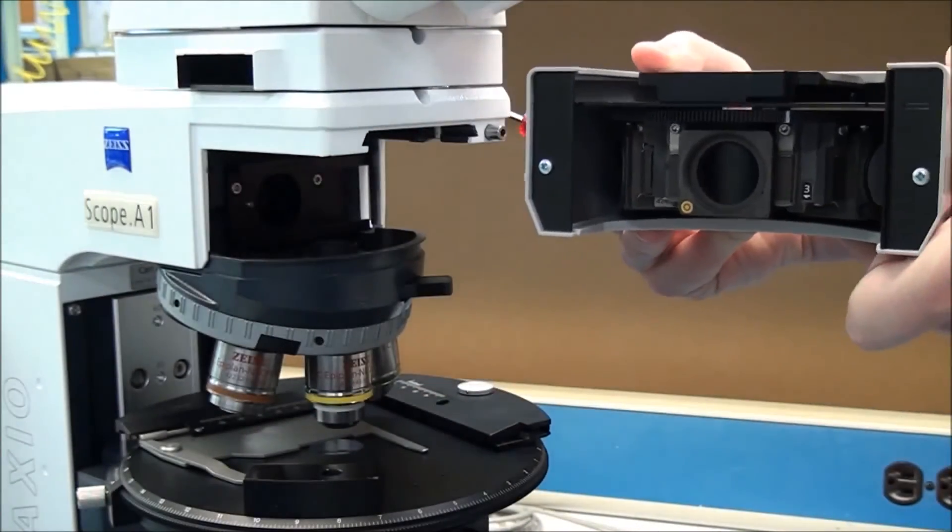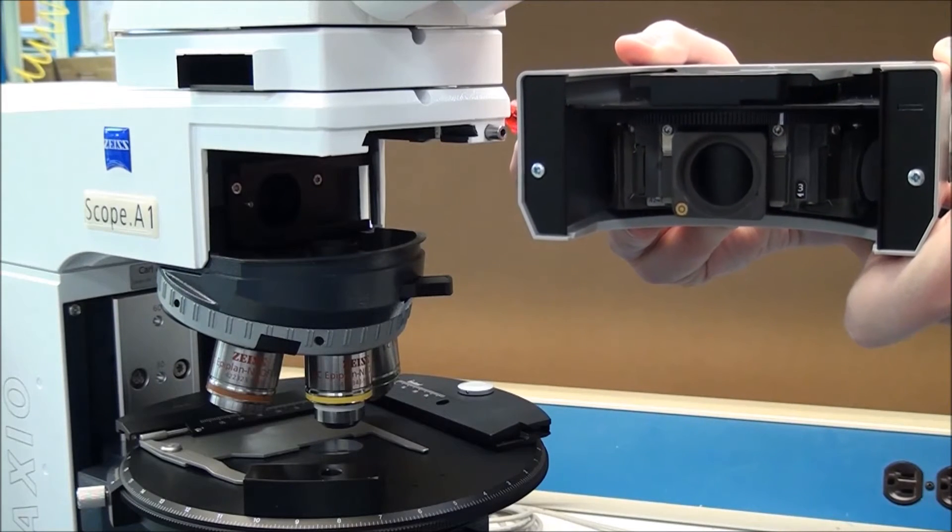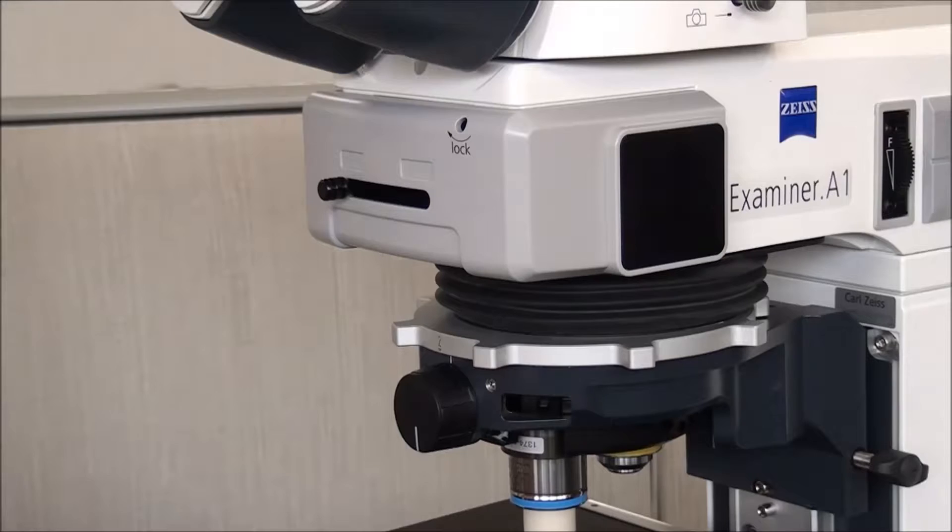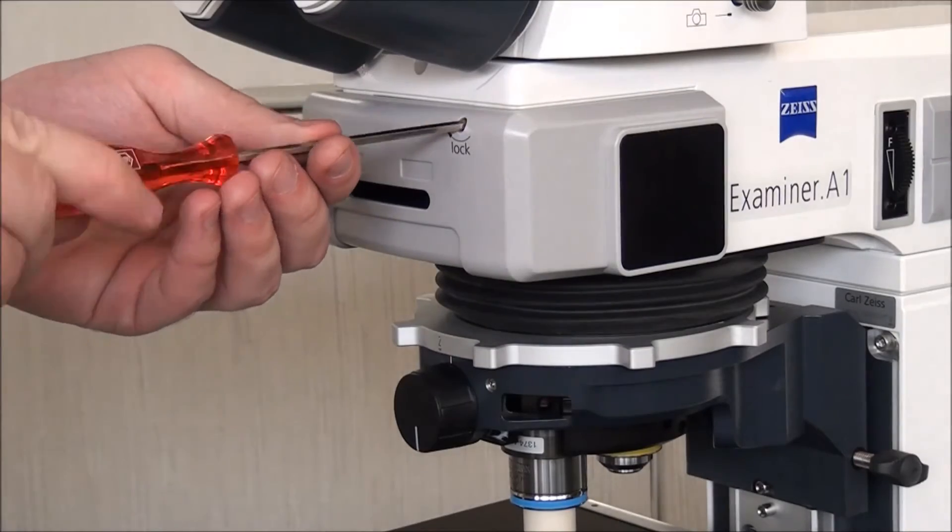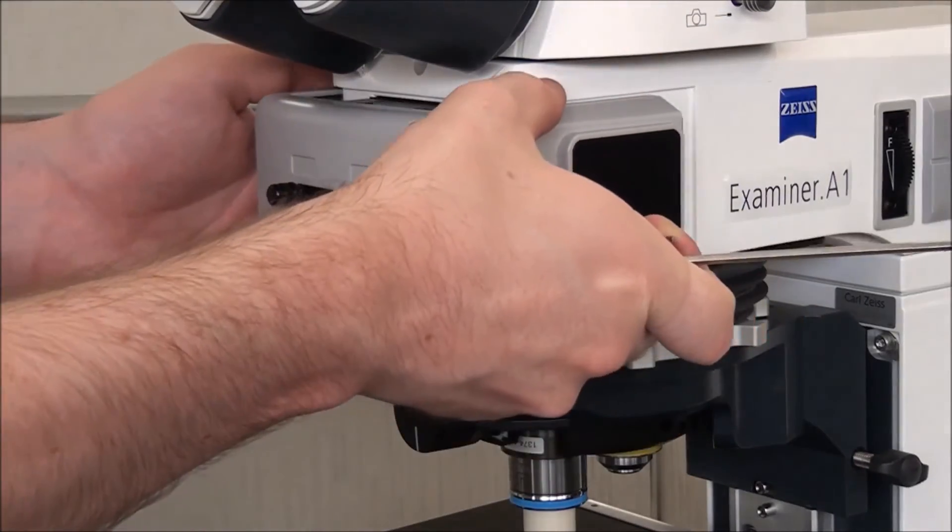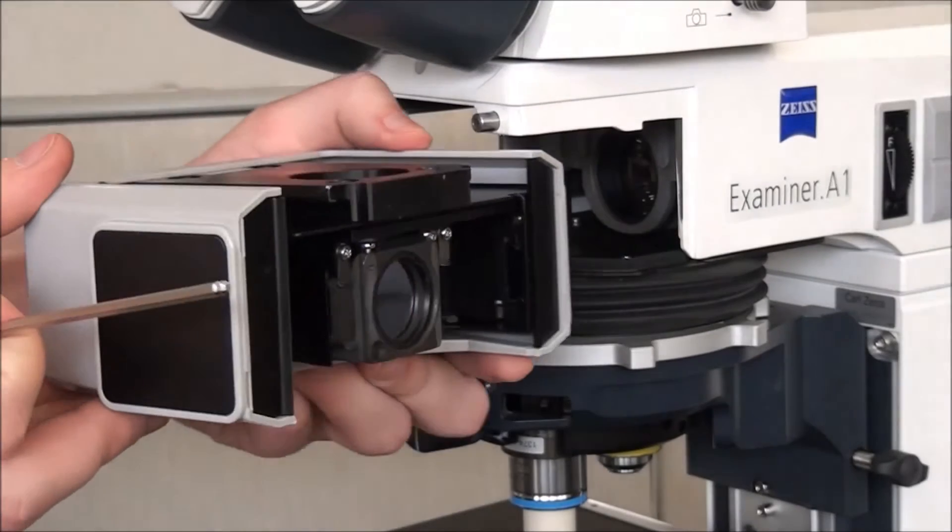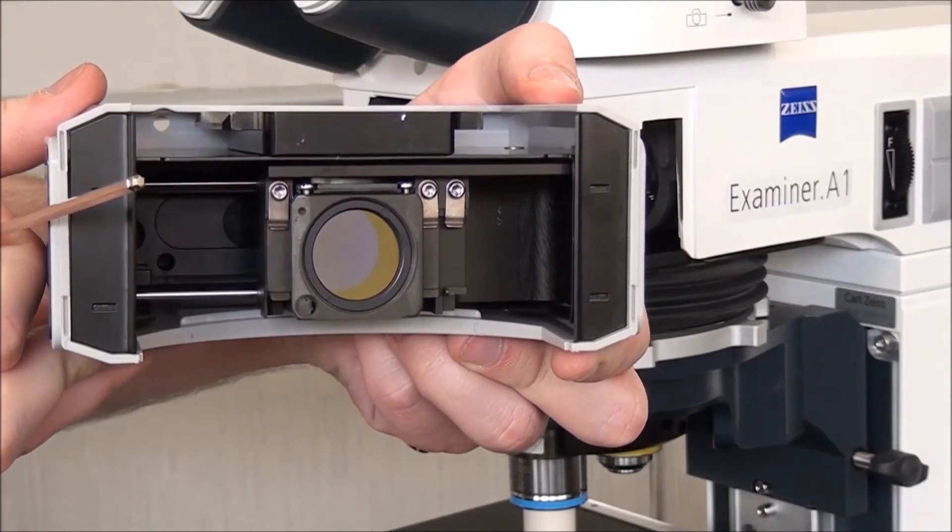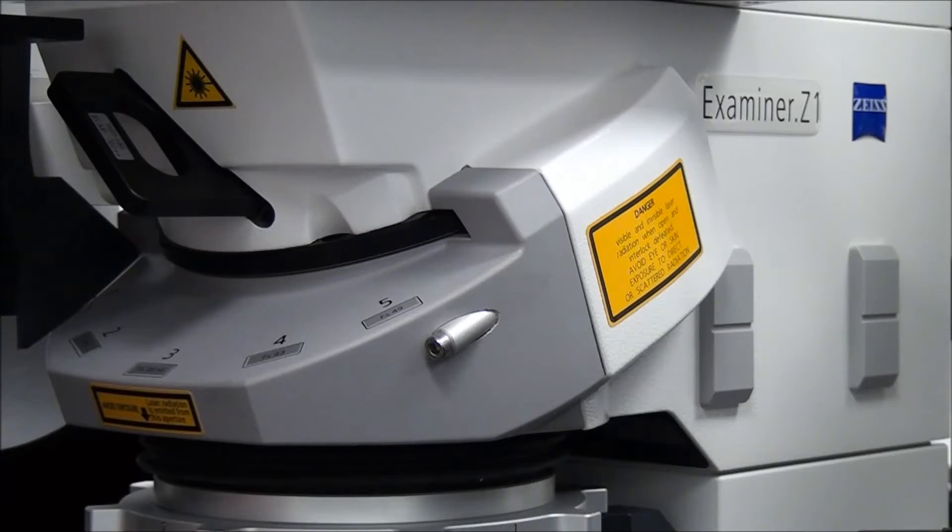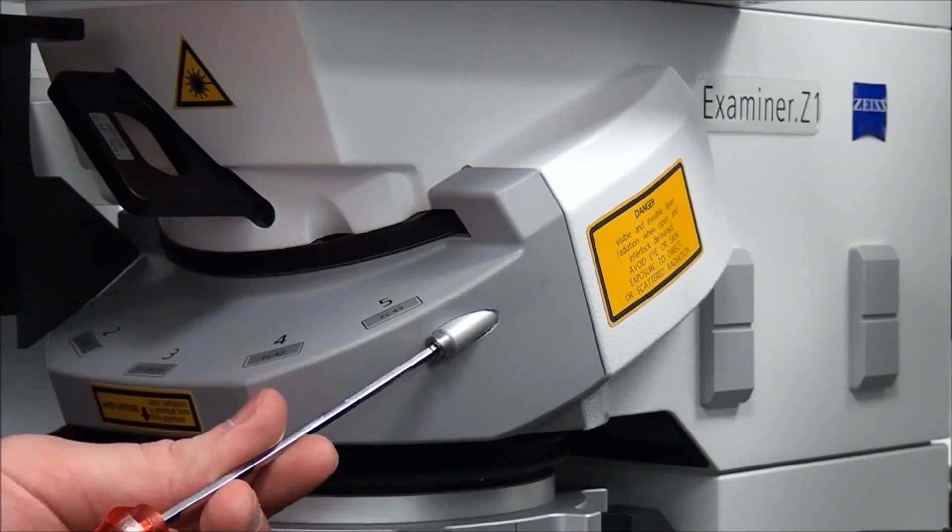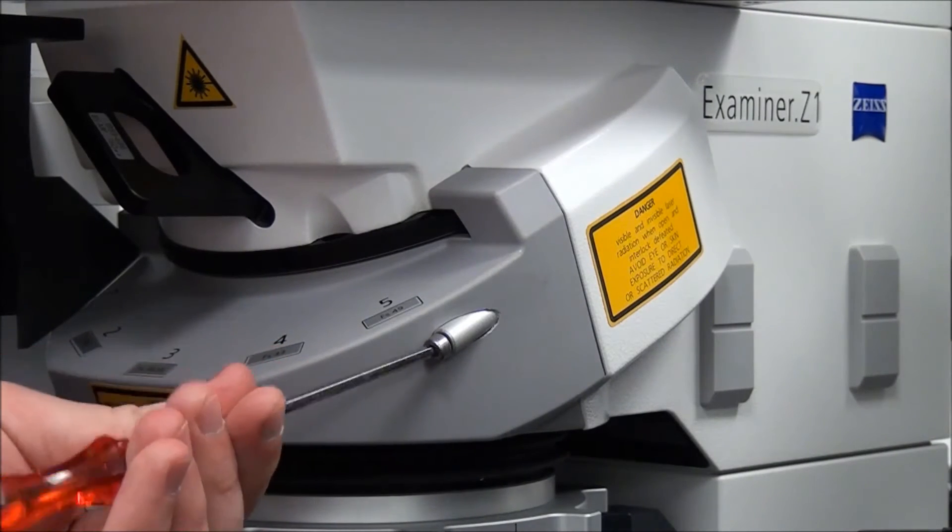On Axio Examiner A1, the reflector changer must also be completely removed using a 3mm hex Allen screwdriver as indicated. On the D1 and Z1 models, the gray cover is removed by loosening the two 3mm retaining screws.